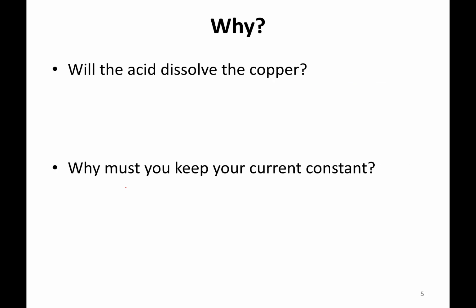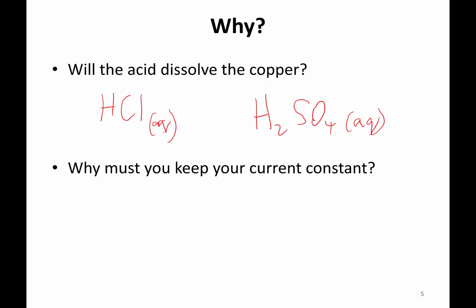Will the acid dissolve the copper? We could say, well, we've got some HCl, we've got 6 molar HCl. We've also got sulfuric acid, right? H2SO4. Will those acids dissolve the copper? Go to your activity series, have a look at copper, and you'll find that copper is lower than hydrogen in the activity series, and so it's not going to dissolve in acid.